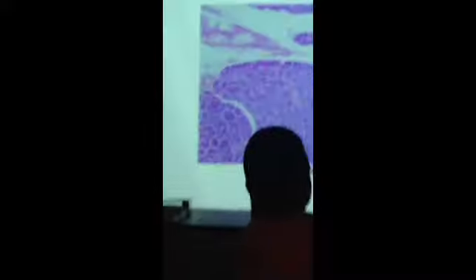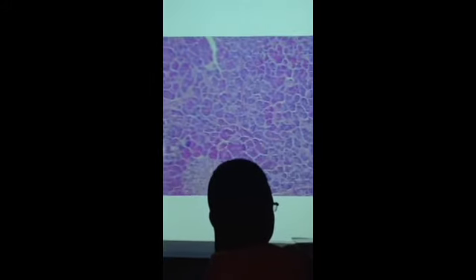What were you saying the white spaces were again, the ones you were saying are like islands? Yeah, right here.